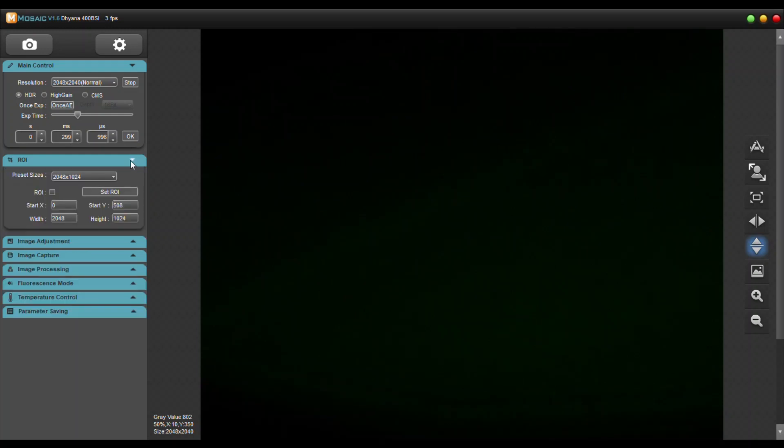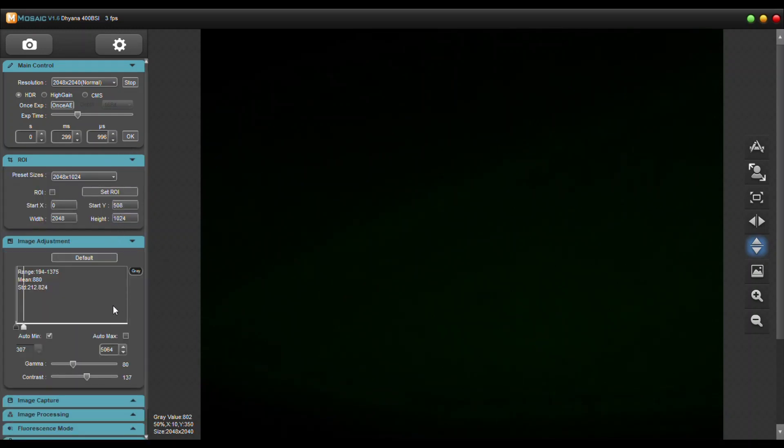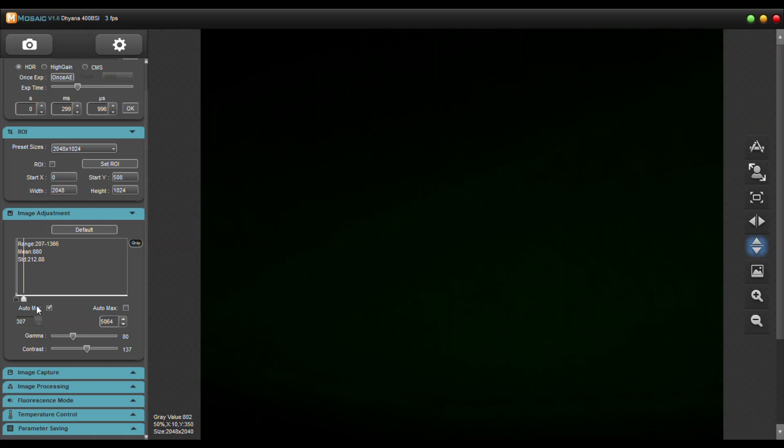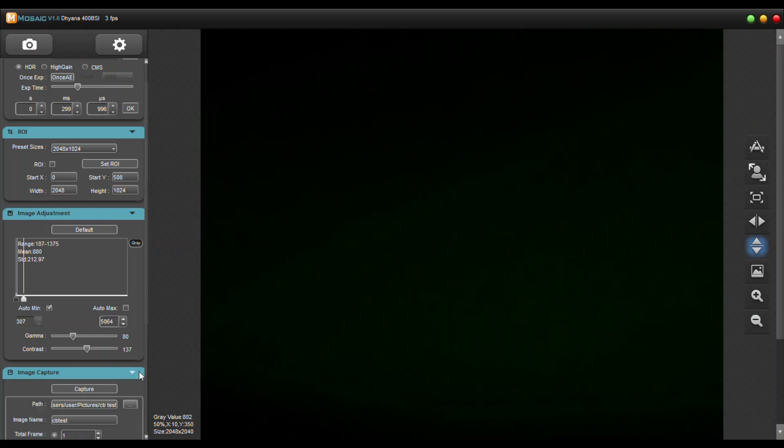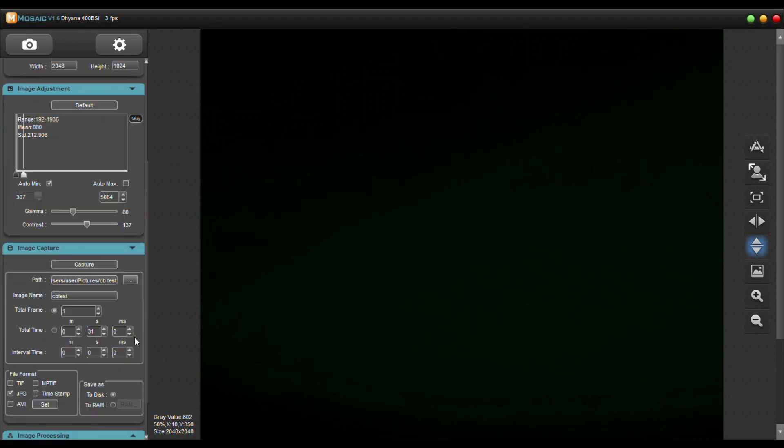Then you have your ROI section, image adjustment section which is kind of like Micromanager with the histogram slider which is very helpful. Then you have your image capture screen. You can set up your captures, how many frames per second.